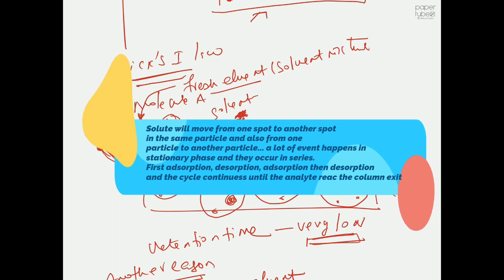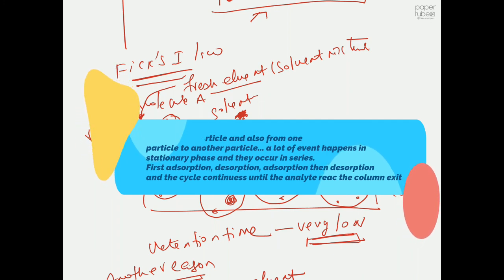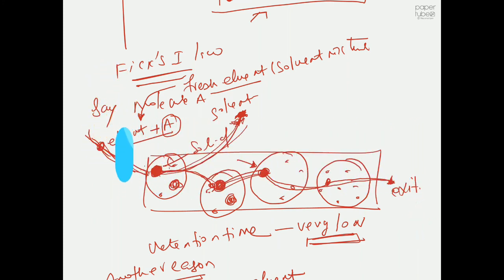So based on this, we have to combine the idea of adsorption phenomena and also the solubility factor. So these are the two things you have to remember. So that's the one reason why the retention time of one of your molecules is very low, and the retention time of another molecule is very high.